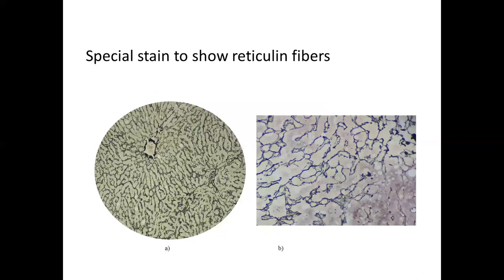As you saw, mucus doesn't stain properly with H&E, and there are many other things — collagen fibers, reticuline fibers, and elastic fibers — that all stain very lightly pink. So if you want to see certain structures not stained properly in H&E, you use a special stain. Here is another slide of the liver, where the hepatocytes are stained in light brown — the liver is stained specially to show its reticuline framework. Reticuline is a protein fiber, a type of collagen fiber, forming the connective tissue framework of the liver.